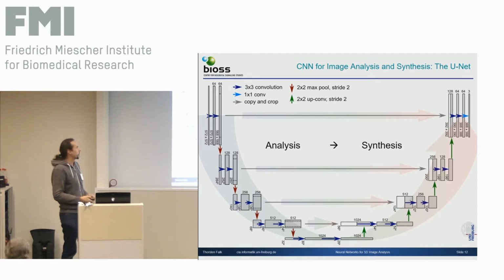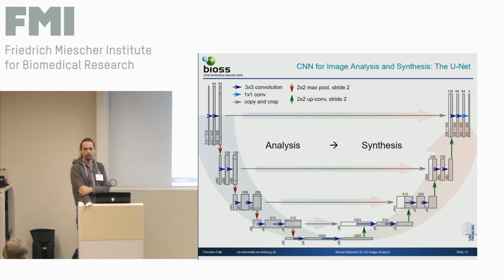Well, when talking about training time, I must admit it trains for a while, depending on how complicated the data set is. It can take from days to weeks. So that's maybe one of the bottlenecks, but the good thing, you don't need to attend training, it trains. And at some point you will have a model that works, and if you train longer, it will work better, and at some point it saturates.